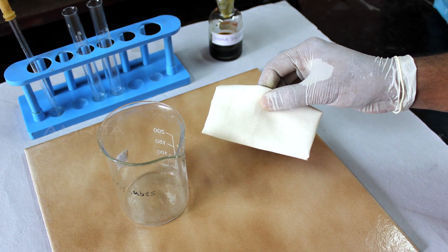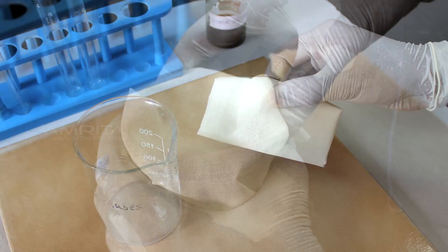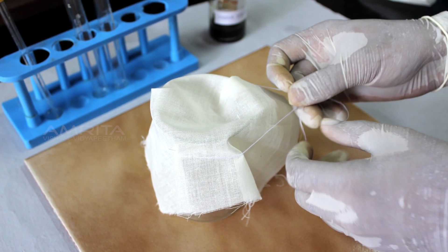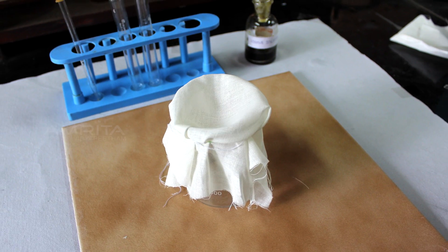Now, take a beaker and a muslin cloth. Cover the mouth of the beaker with the muslin cloth. Secure the muslin cloth by using a thread tied around the beaker.